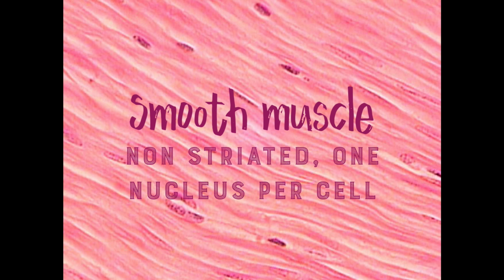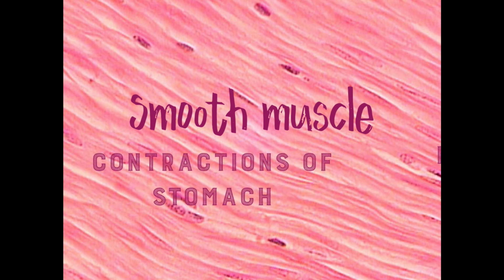Okay, so if you think about what the muscular tissue for cardiac and skeletal muscle look like, as you look at this particular slide, you don't see any striations. There's no alternating dark and light lines. And there's also one nucleus per cell. Now, because this muscle is kind of squished together, it is sometimes hard to differentiate or find that fusiform shape. Some slides will show it a little bit better than others, but you can kind of see here they're all sandwiched in together. And that's clearly very different from skeletal and cardiac. So that's one way that you can differentiate smooth muscle from the others.